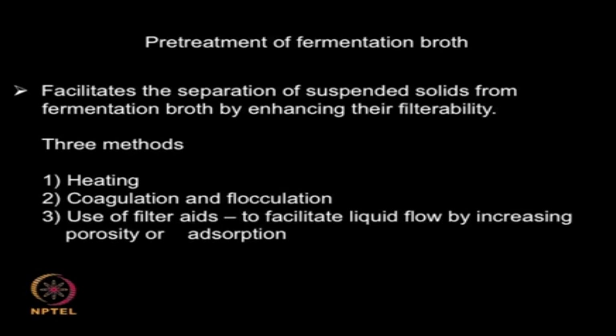This pre-treatment strategy improves the filterability of the broth, because if you recall, after the fermentation the broth may be highly viscous, the broth will contain several types of particles, sticky particles, sand like particles, precipitated salts, dead biomass, metabolites. So you need to improve the filterability, otherwise the whole material may spoil the filtration unit as well as it will slow down the filtration process.